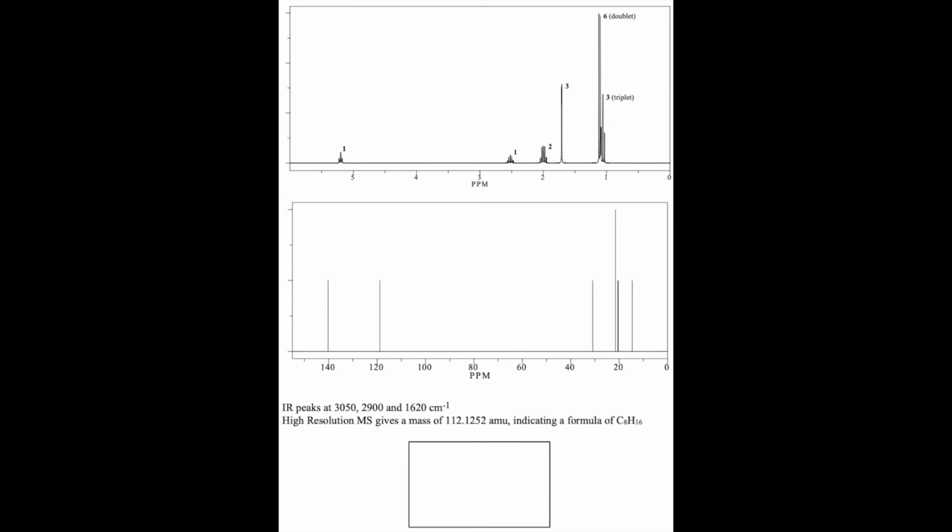So next I'm going to look for interesting peaks with respect to chemical shift. And again, I only have just the one. I have a peak at about 5.2 ppm. And that is in the pi region, the lower end of the pi region. And remember, when you're looking at a proton NMR, you can subdivide the pi region into 3 separate subranges. From about 5 to 6.5 is where you see true alkene hydrogens.